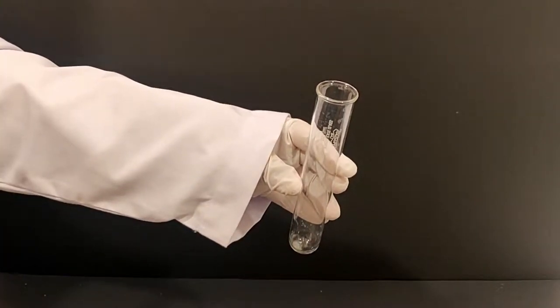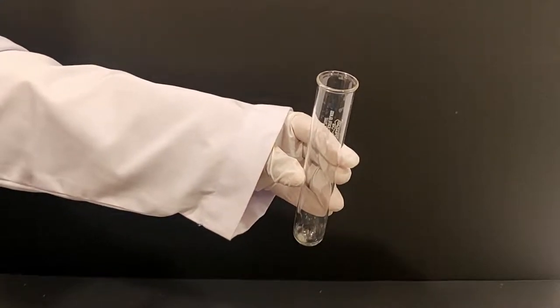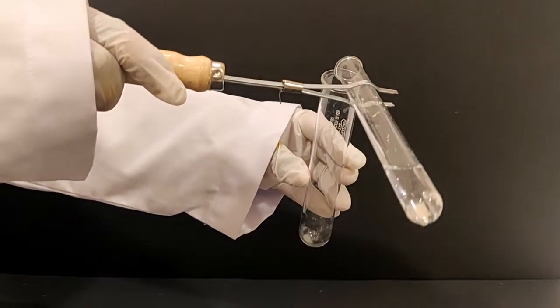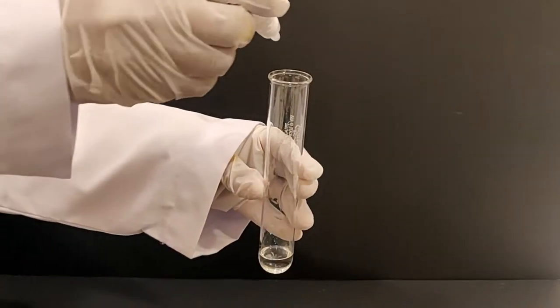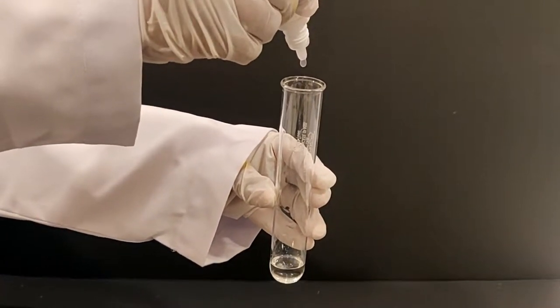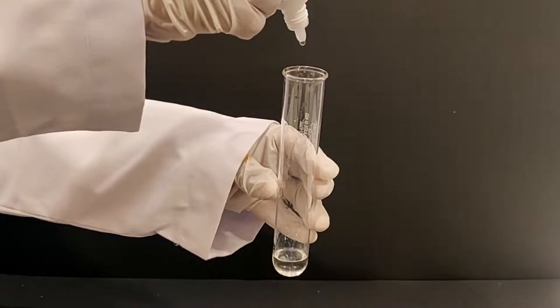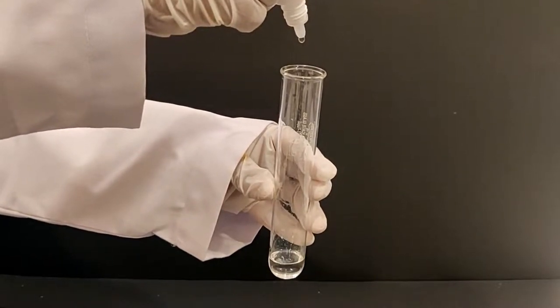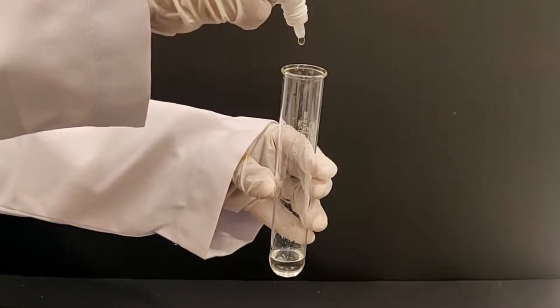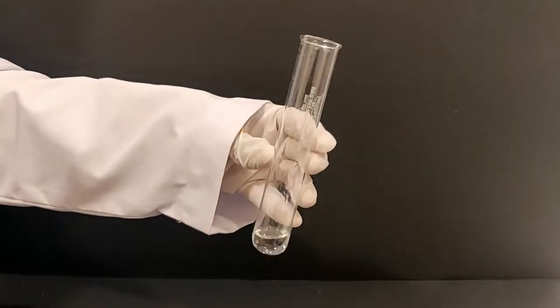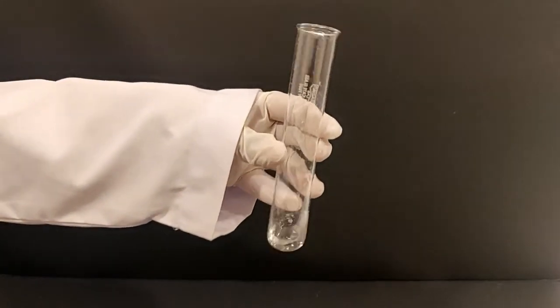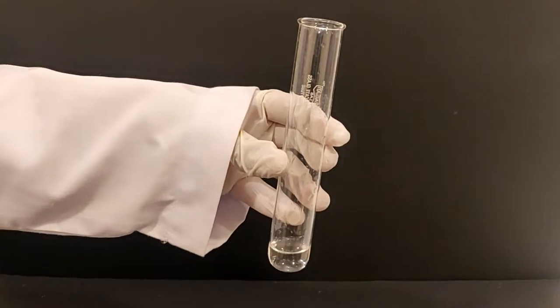In a boiling tube, add about one fourth test tube full of dilute hydrochloric acid. Add about four to five drops of the phenolphthalein indicator to the test tube and gently swirl the test tube to ensure the indicator is fully mixed with the acid.